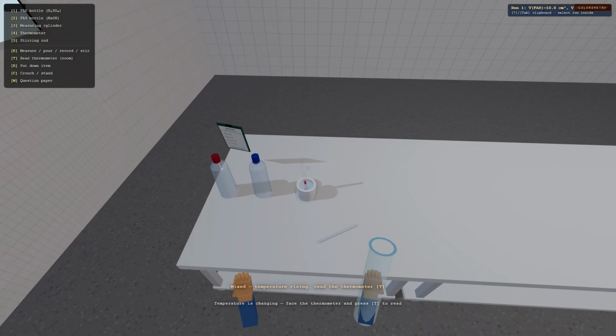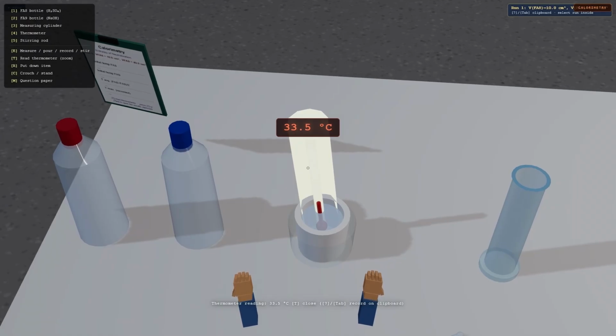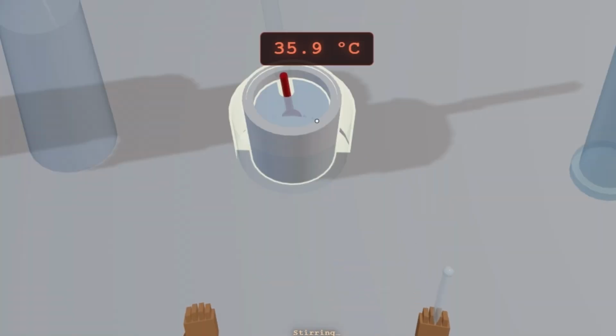Hot, no? And therefore, in today's video, I am going to show you one of the easiest experiments to do for your energetics using my ChemLab simulator so that you don't mess it up, so that you can get the perfect score, so that you can just focus on your calculation in order to score the A for your chemistry practical. But anyway, with my ChemLab simulator, you don't have to off the fan, you can be in an aircon room and then you just have to sit in front of your computer.